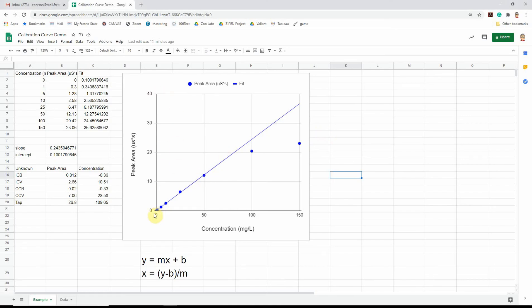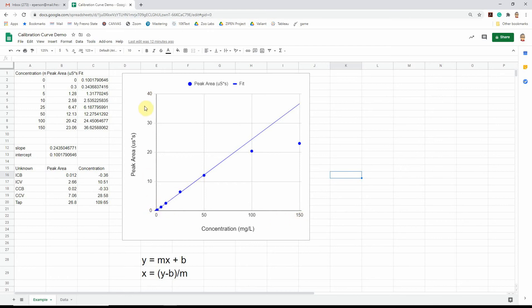The calibration curve is made by taking some standards, some samples of known concentration, in this case the blue dots. So we know the concentration here on the x-axis. And then we run them through the instrument and we measure the response, the instrument signal on the y-axis. And that's the data that's in the table right here.